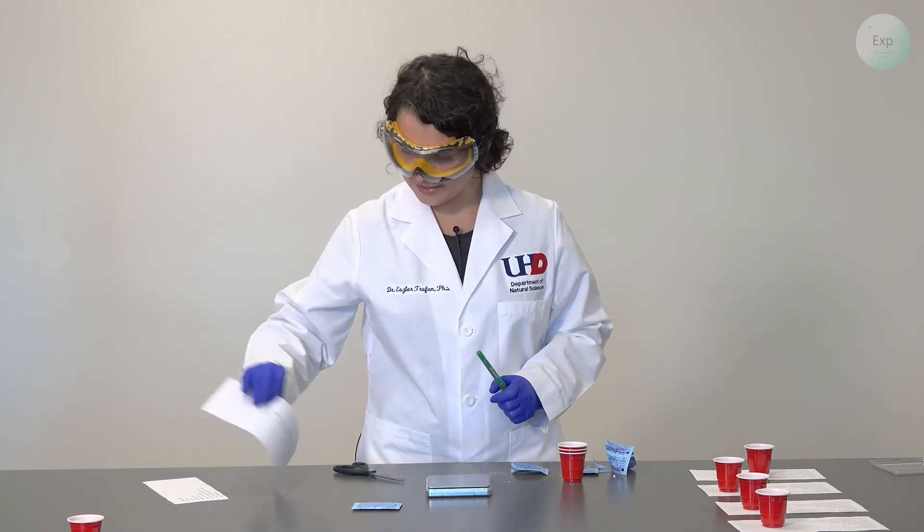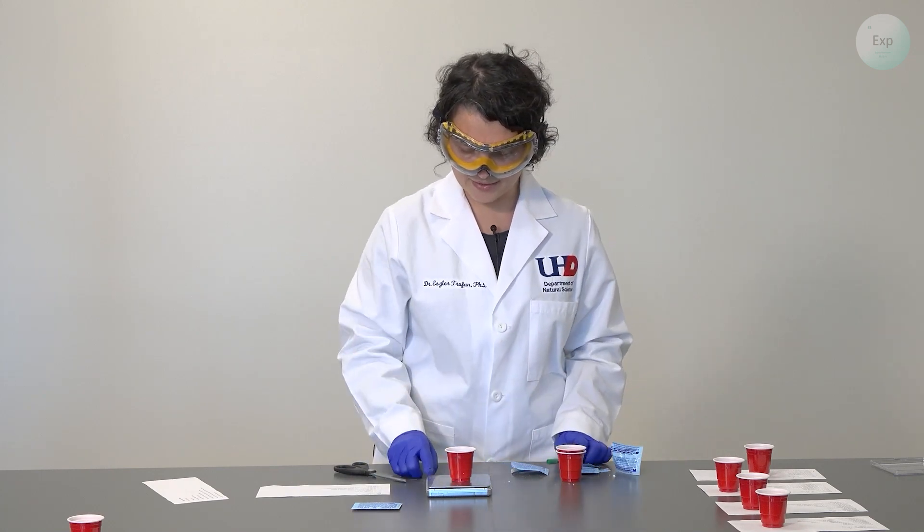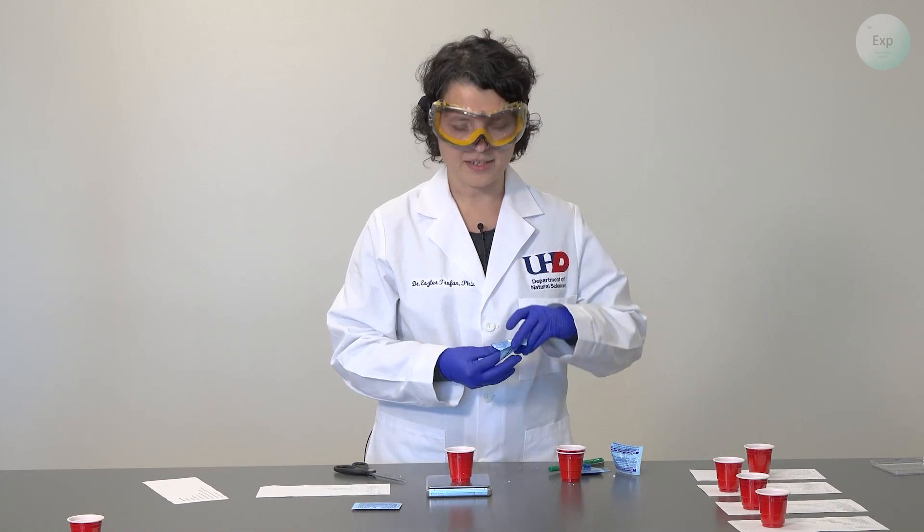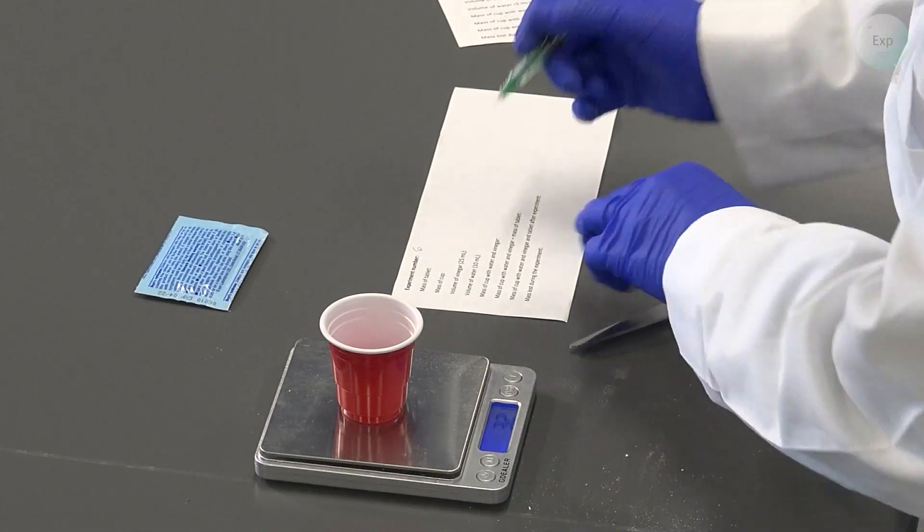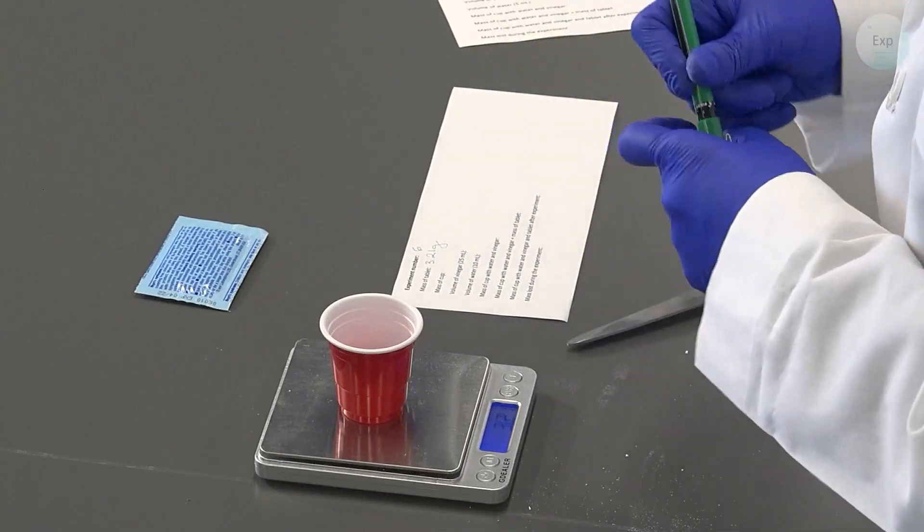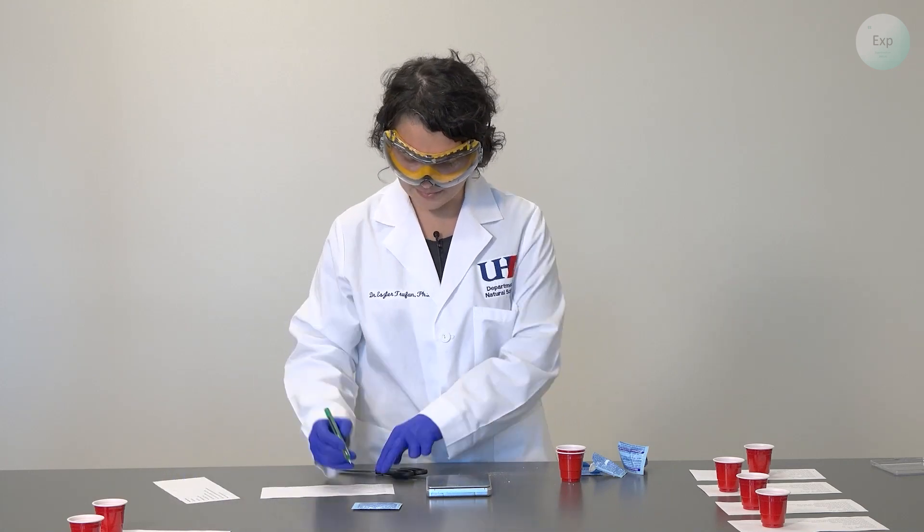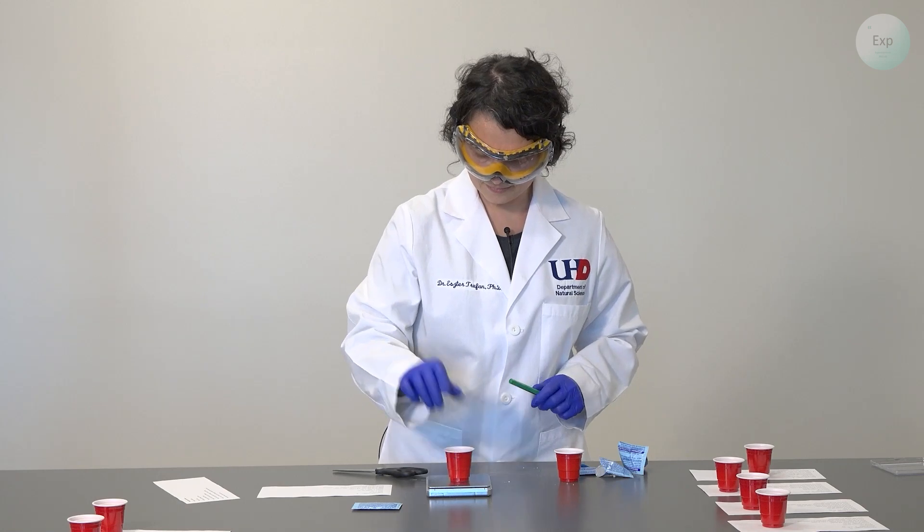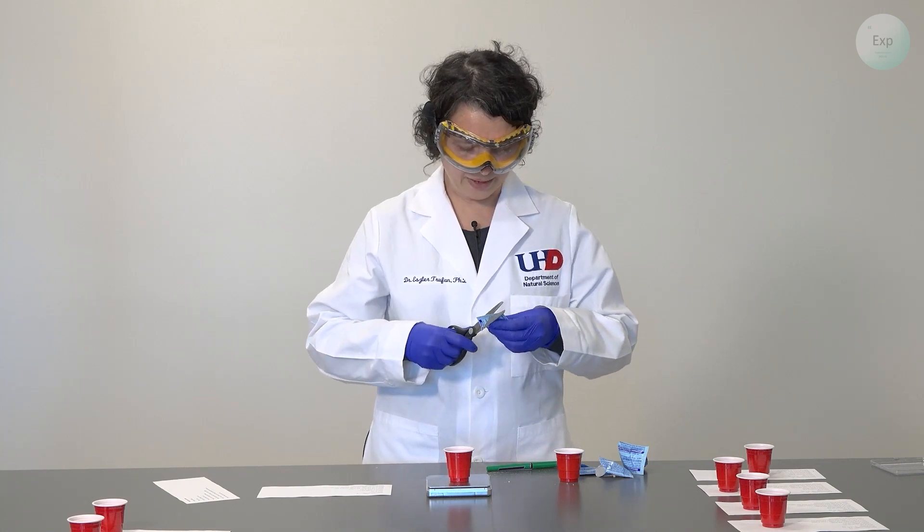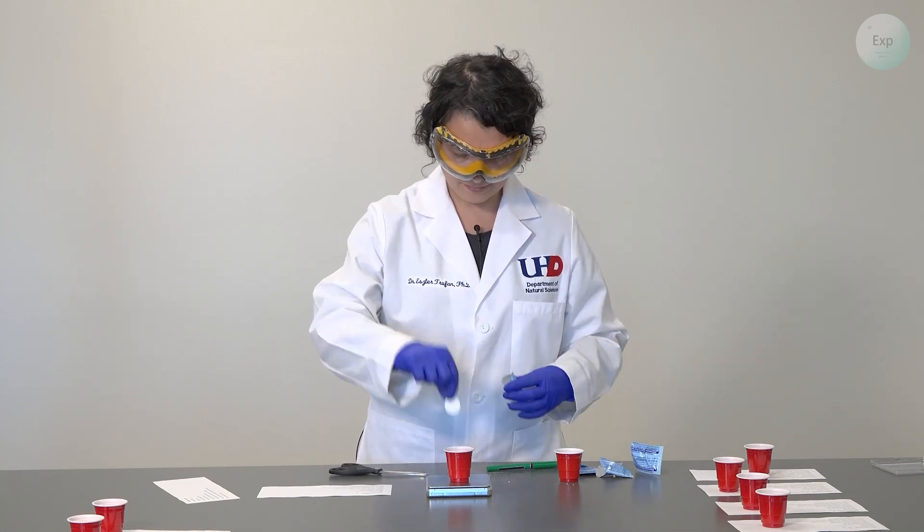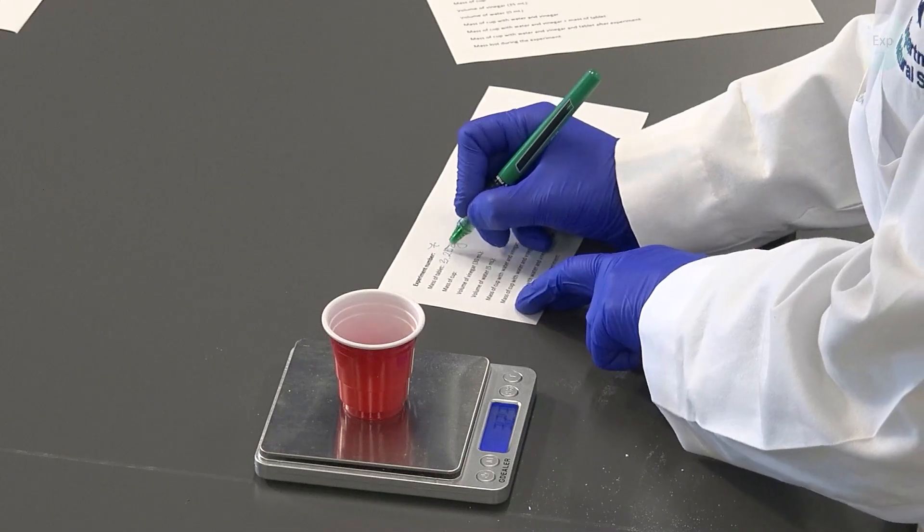For experiment six we place the cup on the scale, tare it and then extract the sixth tablet. Its mass is 3.21 grams. For experiment seven we open our final pouch and record the mass of our tablet which is 3.23 grams.